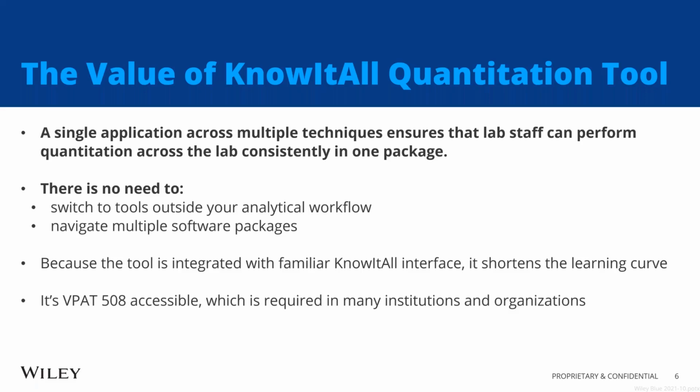It is also VPAT 508 accessible, and we are continuously working to improve accessibility. So our quantitation tool offers consistency, time savings, streamlined workflow, reproducibility, reduced training time due to a single software package. This is quantitation done properly and consistently.